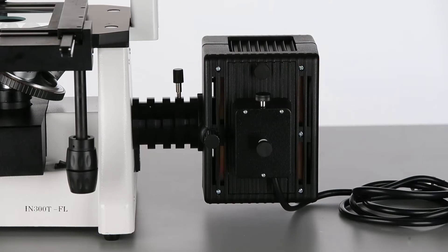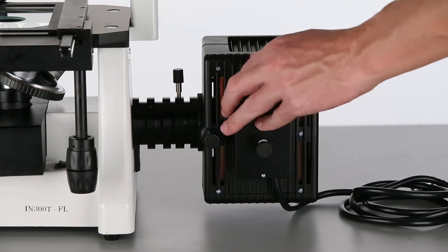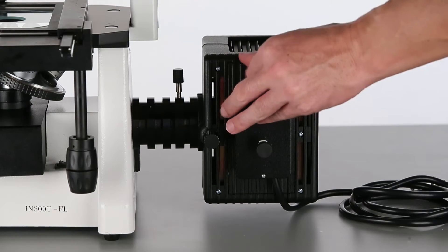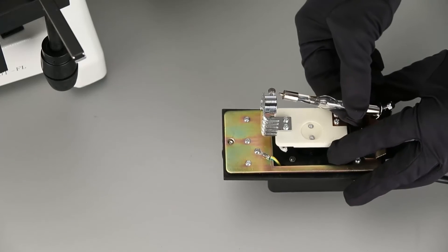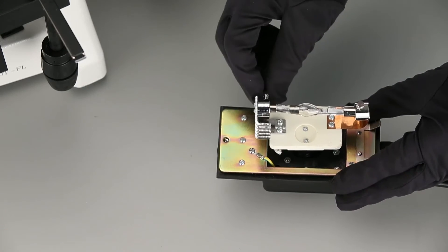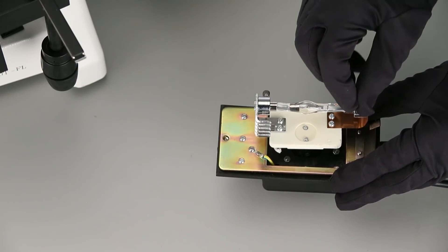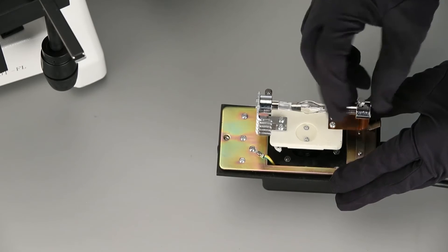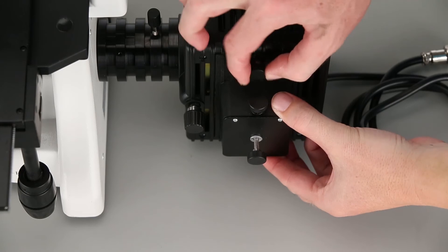By unscrewing the top knob, the access panel may be opened. Insert each end of the bulb into a receptacle, then tighten the locking screws to securely fasten the bulb in place. Now reattach and close the access panel and tighten the knob.